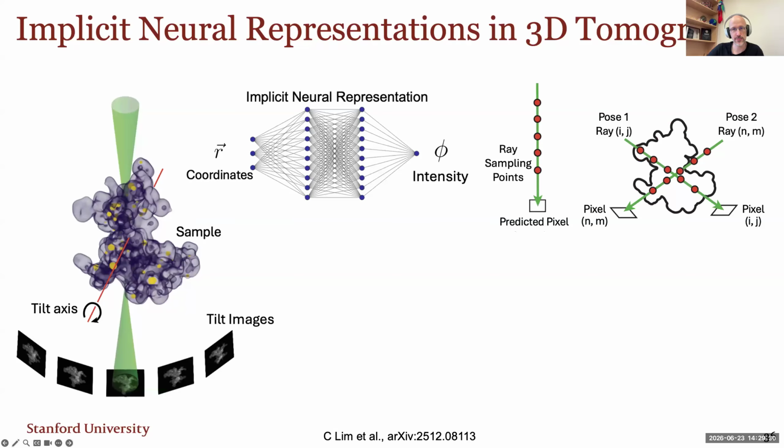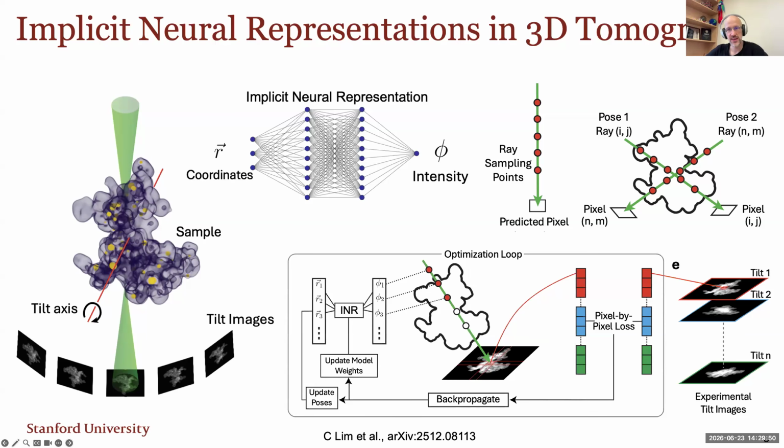To adapt this to tomography, all you need to do is sample along different rays. Because for our projected image in ADF-STEM tomography, we are assuming you take the sample reconstructed volume, whatever it is, and add it up voxel by voxel, and when you reach the end of the object, that's the predicted intensity of that pixel. So the entire reconstruction loop looks something like this.